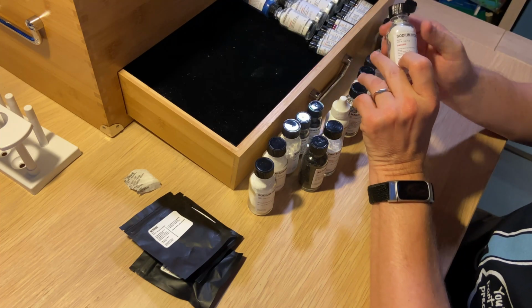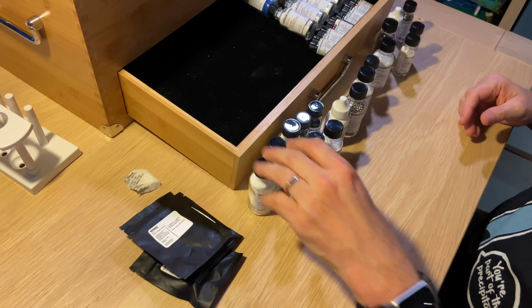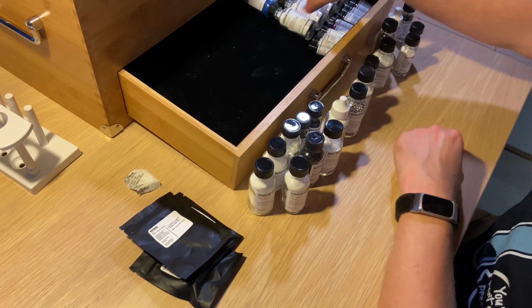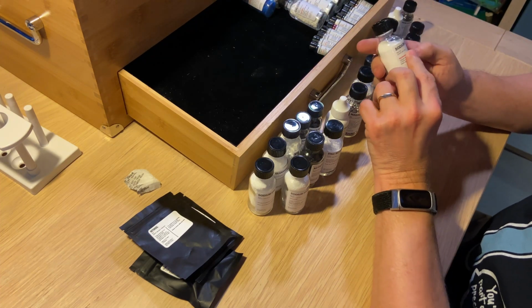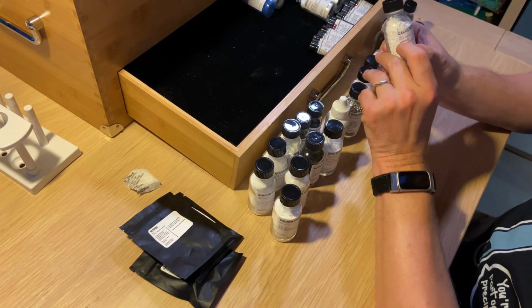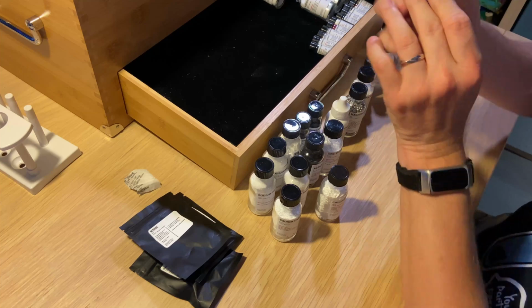We have sodium hydroxide. We know this from the live video. And the thing is that most of these chemicals are actually white. There's a few exceptions, but most of them are white. I'm happy that they put these labels on because otherwise I couldn't have told the difference. Sodium carbonate. Calcium chloride. Oh, this is beautiful. Take a look at this.